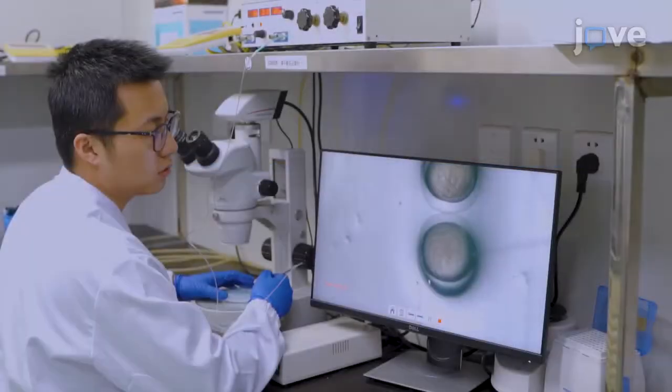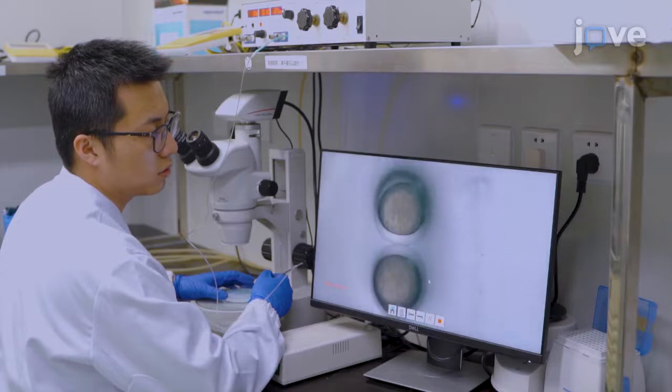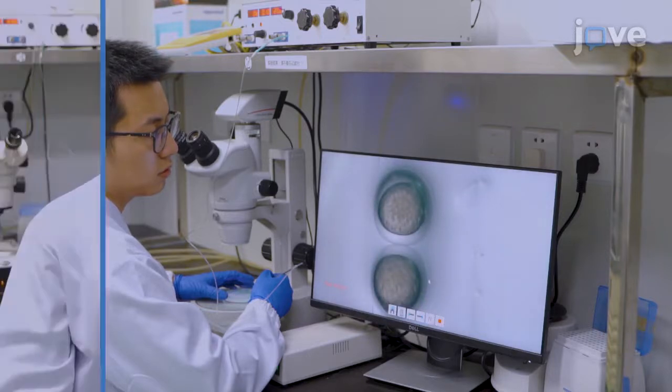Working under a microscope, use the femtojet system to inject 2 nanograms of morpholinos and 500 picograms of mRNA into one-cell embryos. Practice the microinjection of morpholinos many times until you can inject it into cells successfully and keep the integrity of the eggs.